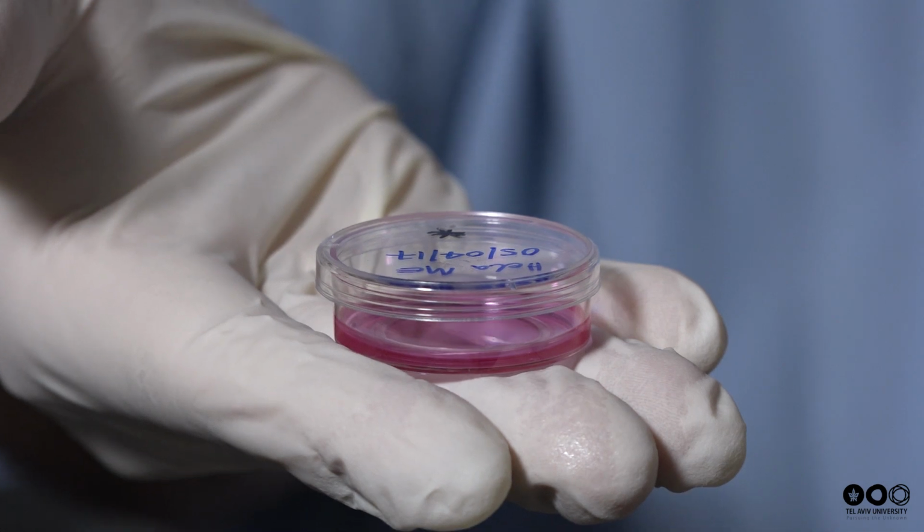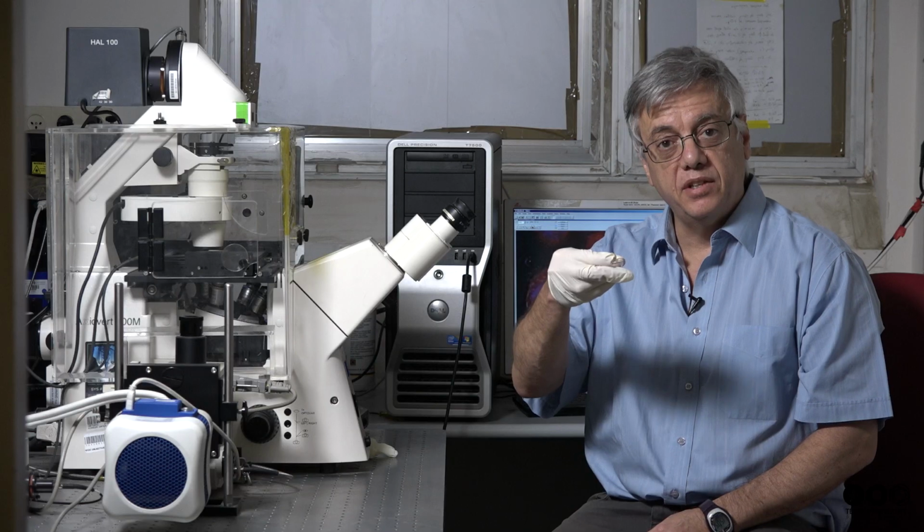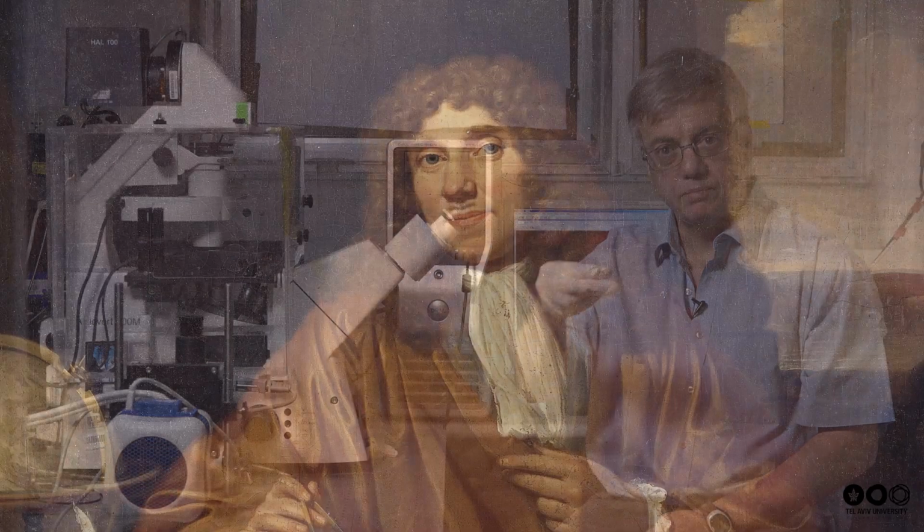In order to observe specific intracellular compartments and organelles, we have stained these cells with colors so as to be able to observe the nuclei and mitochondria. This Petri dish that I now hold has 200,000 of these living HeLa cells. Let's go to the microscope and look at them.